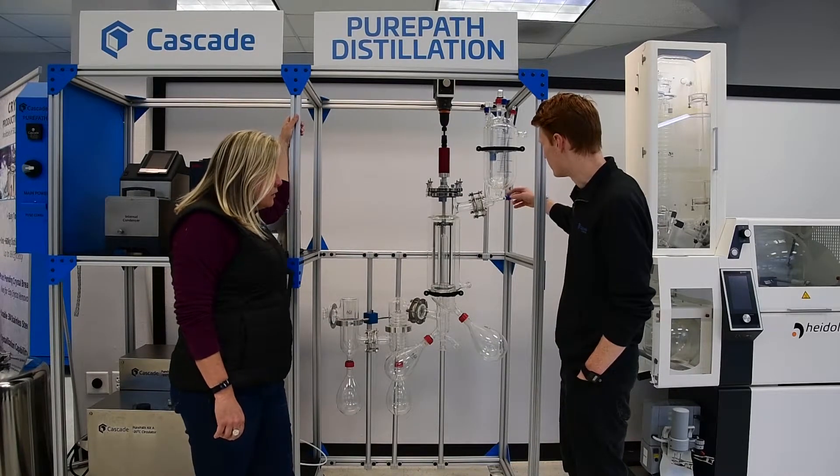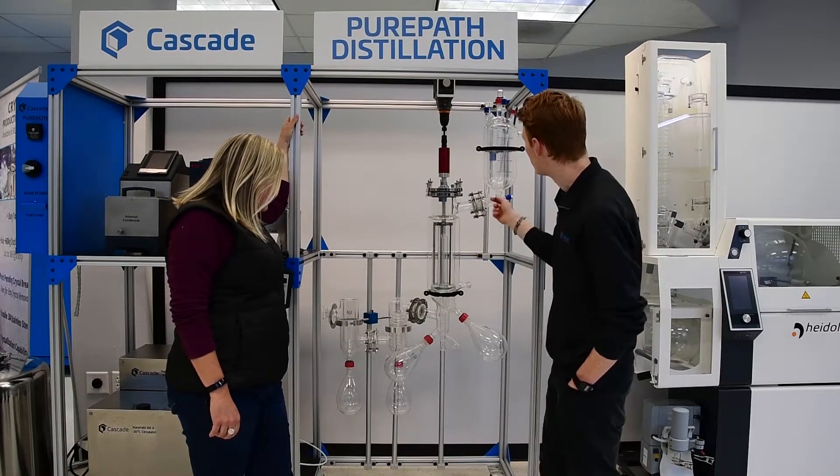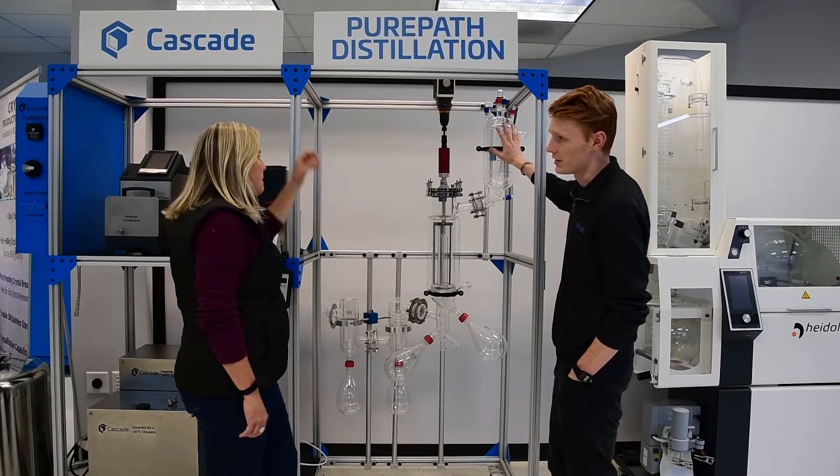So this controls the flow rate at which your crude is going to be dripping down into the column. We have this candy cane here that allows you to add or remove vacuum from your feeding flask.